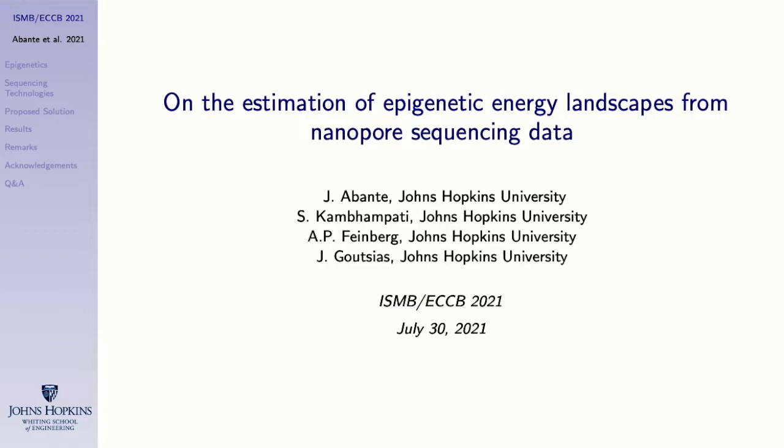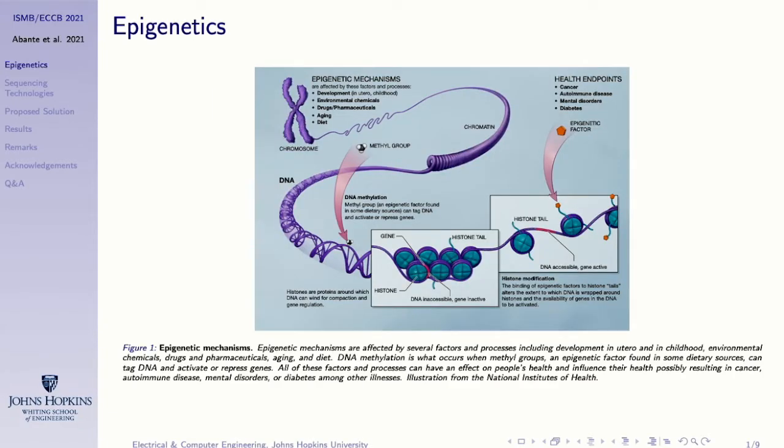Today, I will be talking about some of our latest work on epigenetic energy landscapes and estimation of these landscapes from nanopore sequencing data.